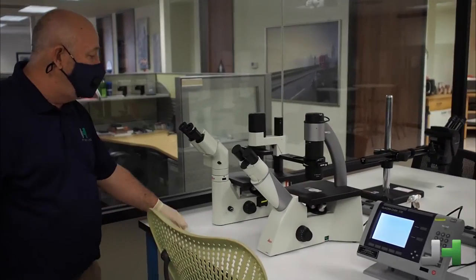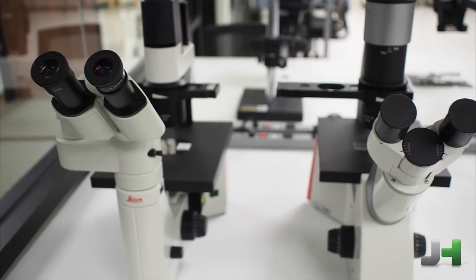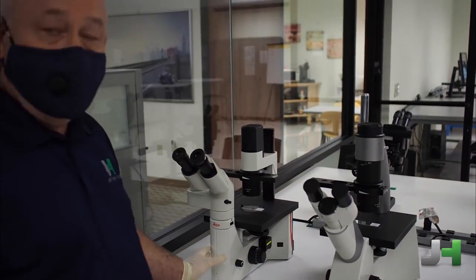We also have inverted microscopes, biological microscopes, primarily for cell counting, tissue culture applications, and for education.